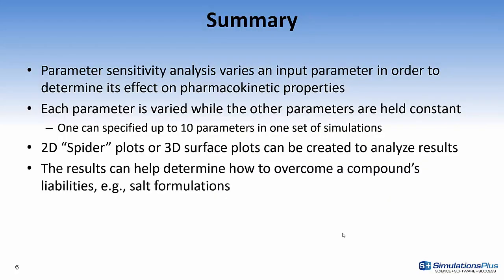So, in summary, parameter sensitivity analysis allows one to vary an input parameter in order to determine its effect on pharmacokinetic properties. Each parameter is varied, while the other parameters are held constant. One can specify up to 10 parameters in one set of simulation. The parameter sensitivity analysis is analyzed with spider plots. You can also create 3D surface plots if you're only varying two properties at a time. These results can help determine how to overcome a compound's liability. For example, maybe if it's solubility limited, you could come up with a new salt formulation that would increase its solubility and, therefore, maybe increase its fraction absorbed.